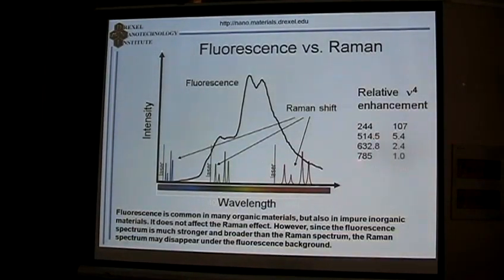So, just to give you an example, you can enhance significantly, because again, the difference in frequency comes to power 4, your signal to noise ratio by changing the excitation wavelength. So this is also a reason why many laboratories have a variety of excitation wavelengths. It's typically not enough to have a single laser unless you work with a very specific material and you know this particular one is the best. And also, some people use tunable lasers to obtain any wavelengths required.